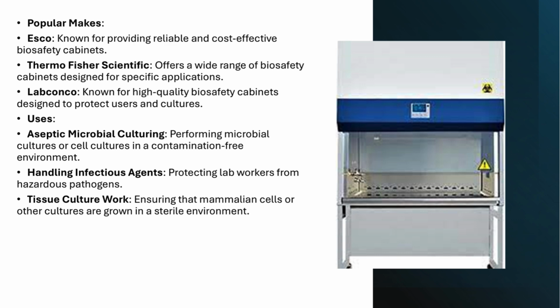Tissue culture work. Another key use is in tissue culture work, where mammalian cells or other sensitive cultures are grown. The sterile environment ensures that no unwanted microorganisms interfere with the growth or experimentation of these cultures. In conclusion, biosafety cabinets are indispensable in microbiology labs, providing both safety and a sterile environment for researchers and their cultures. Whether you're growing microbes, handling infectious agents, or working with delicate tissue cultures, these cabinets ensure that the work is done safely and contamination-free.